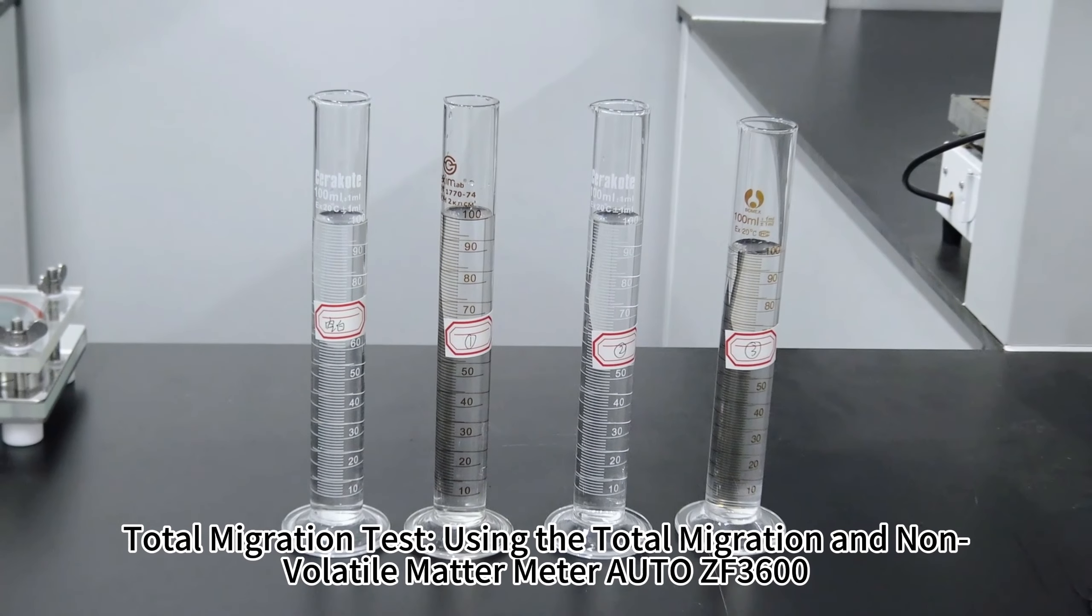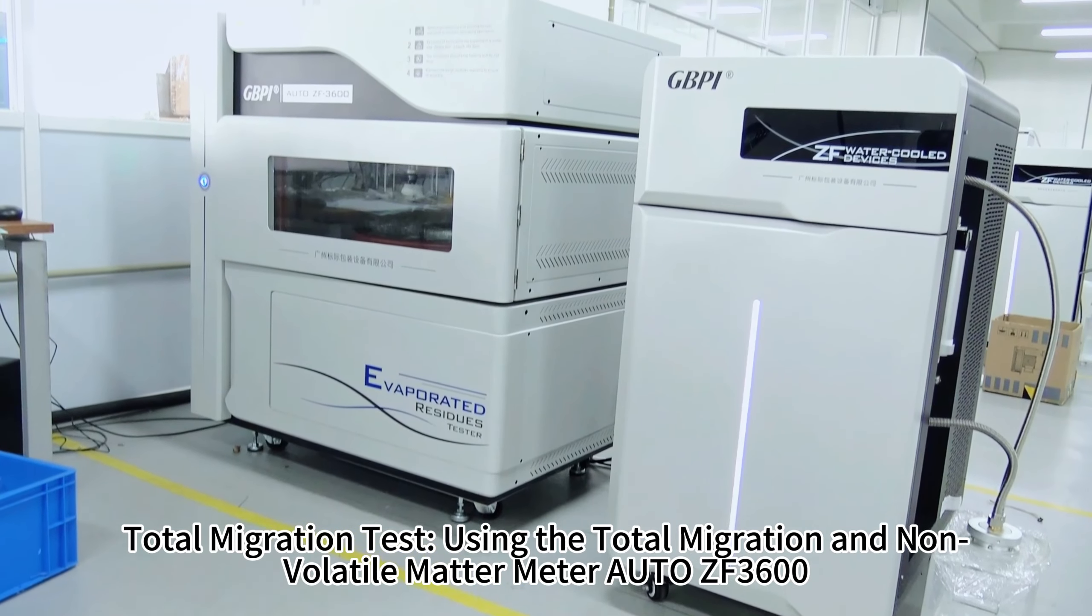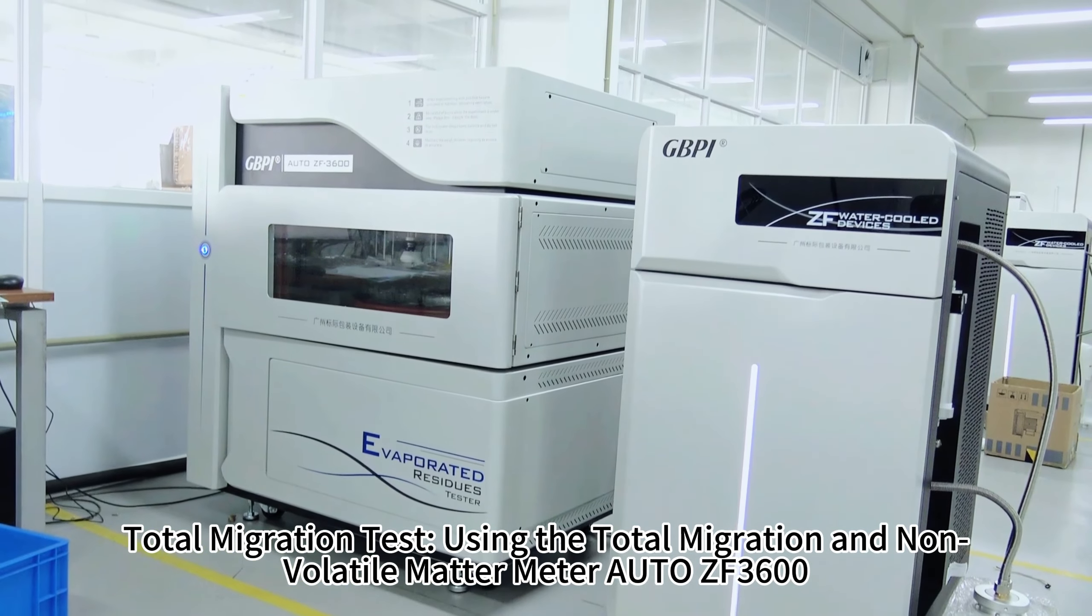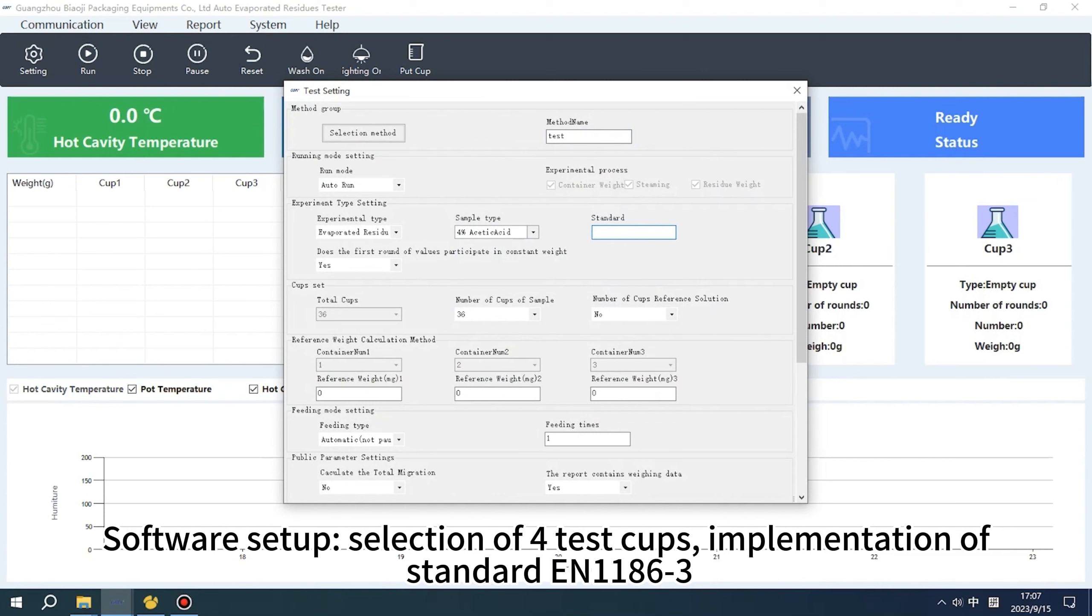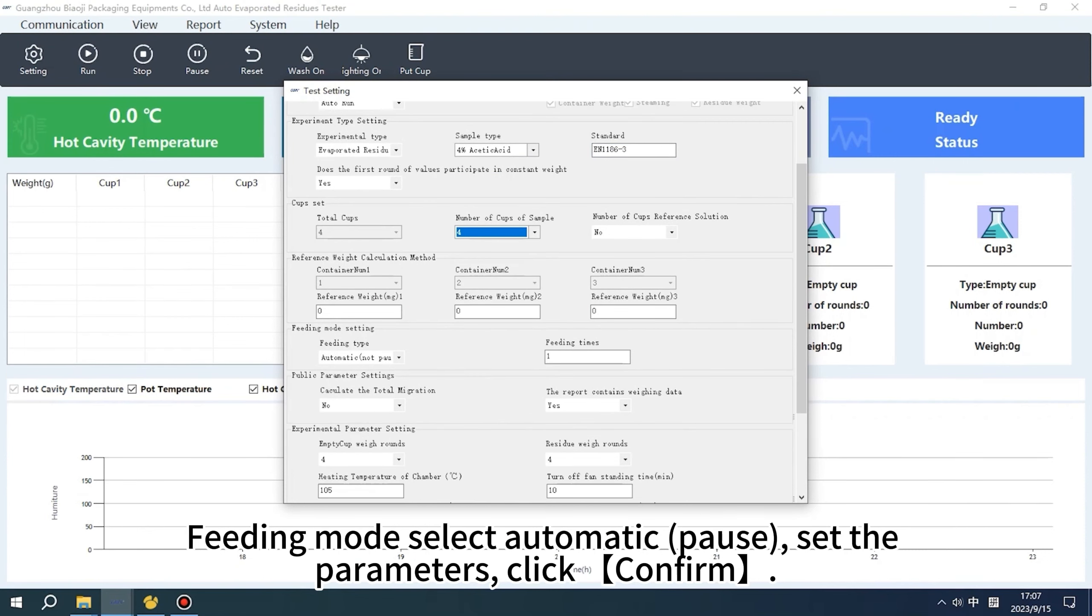Total migration test using the Total Migration and Non-Volatile Matter Meter Auto ZF 3600. Testing of food simulants after migration test immersion. Software setup: selection of 4 test cups, implementation of standard EN 1186-3.